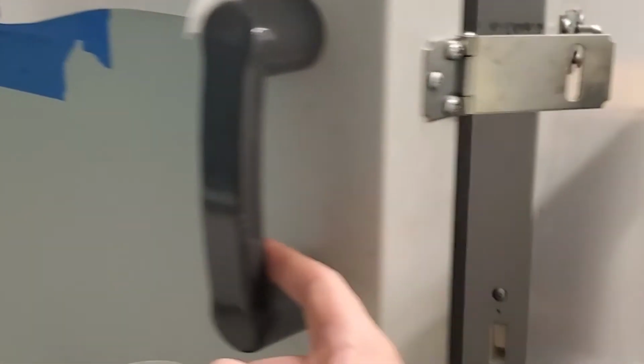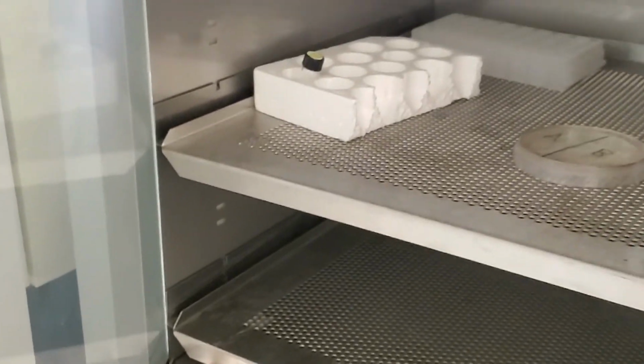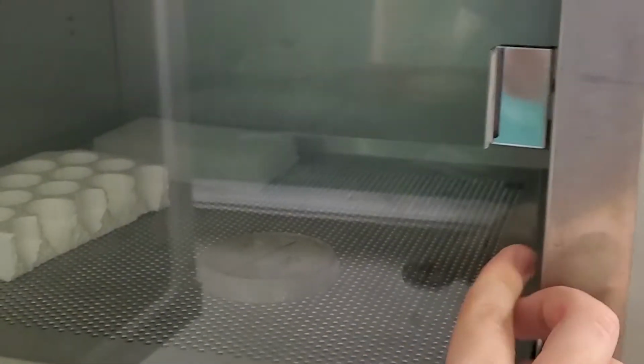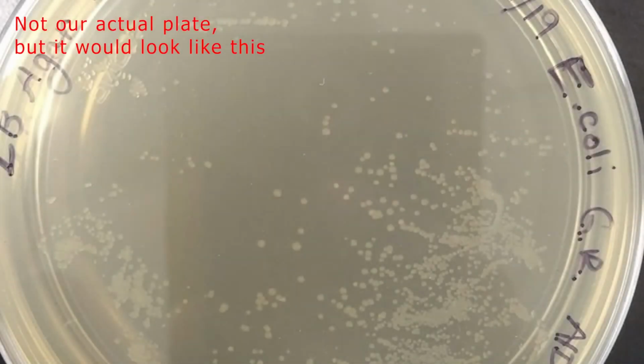This plate should be incubated in a normal, non-shaking incubator at the same temperature as you used previously. In the next few days, you should begin to see colonies on your plate.